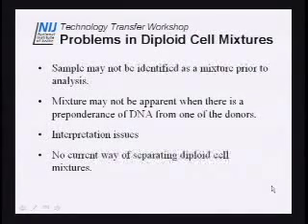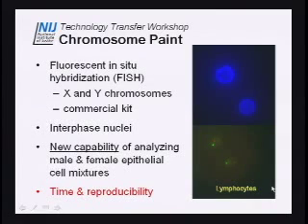Earlier today, I started this lecture, and as I said, I wanted to get the fluorescent sperm identification done before we got into the room so y'all can have some idea about what you were looking at. But the other part of the advances in the microscopy is the fact that we can now do other stuff with fluorescence, especially what we cannot do in forensics now, which is diploid cell mixtures.